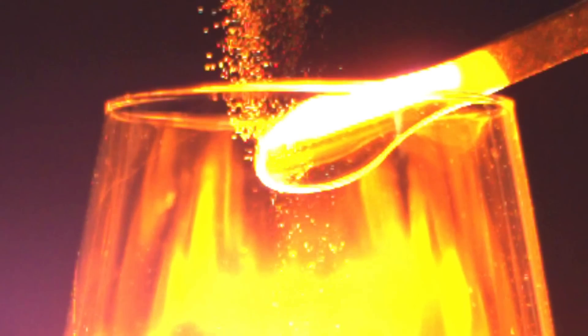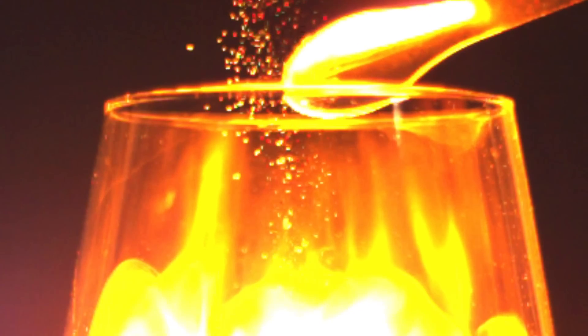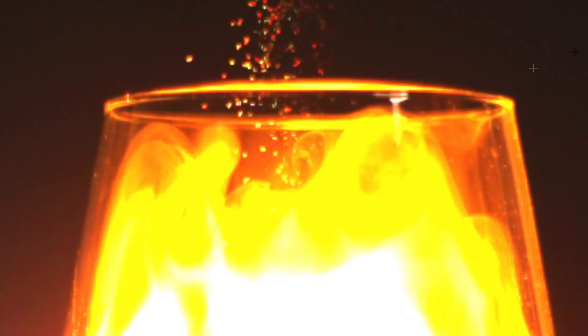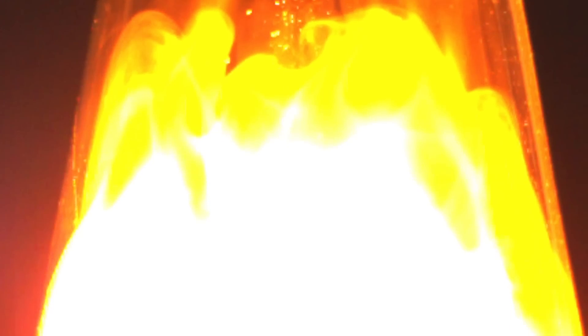That looks so unreal — it's like spacecraft being burned by the sun. Okay, so that's kind of fun. Let's come back again and trace our flame, take a close look at the ignition sequence start.